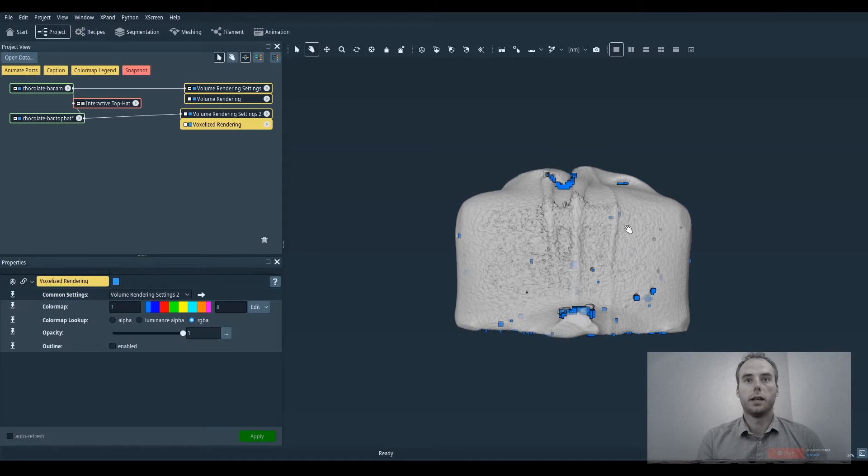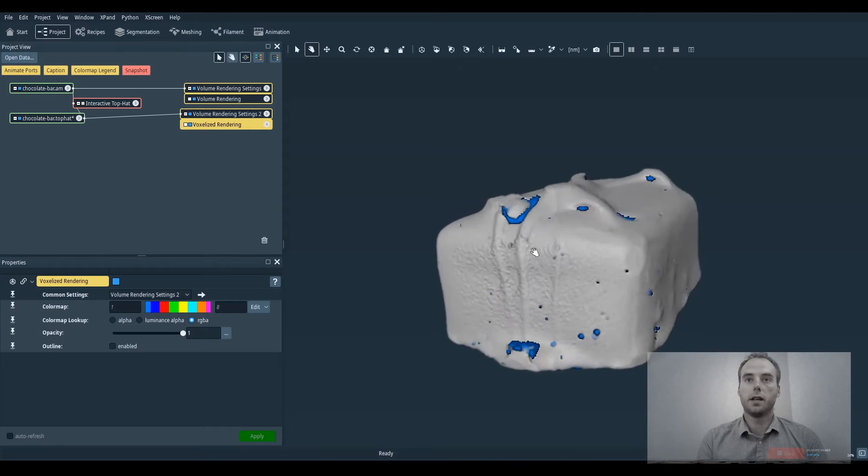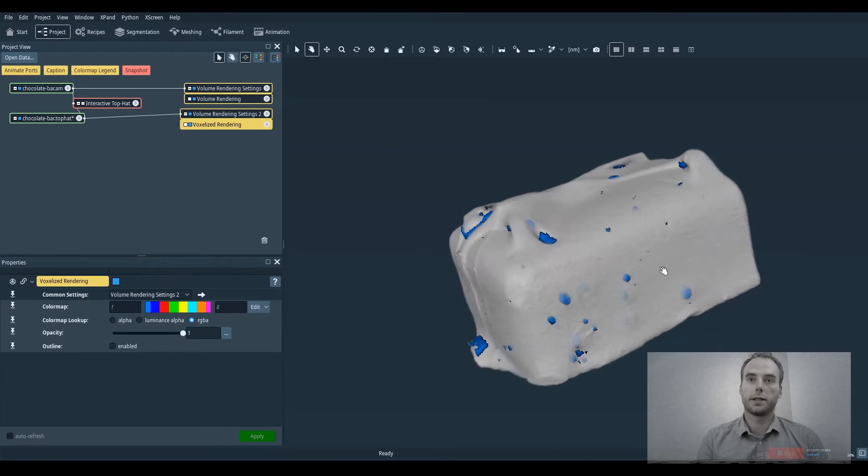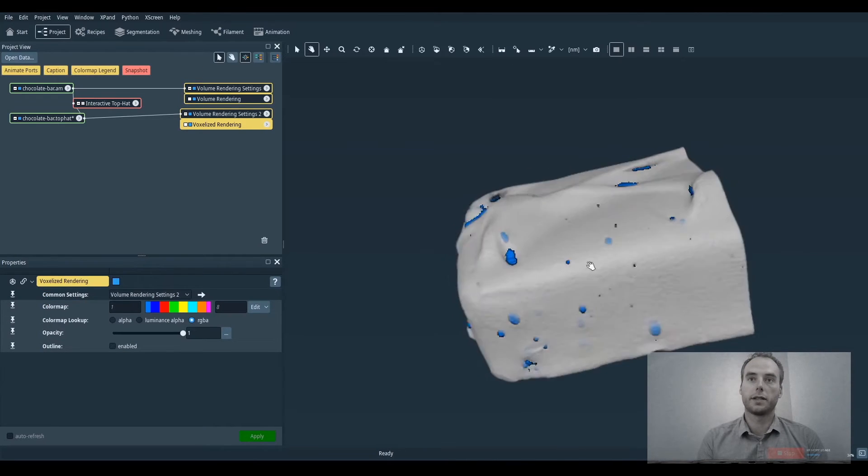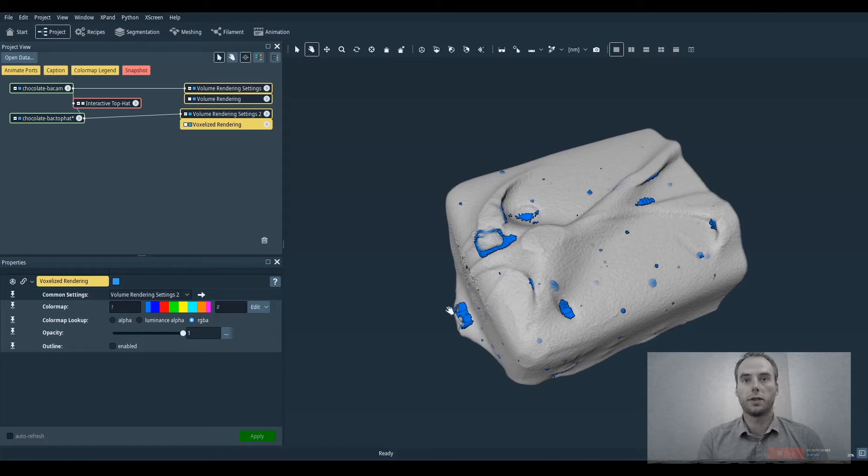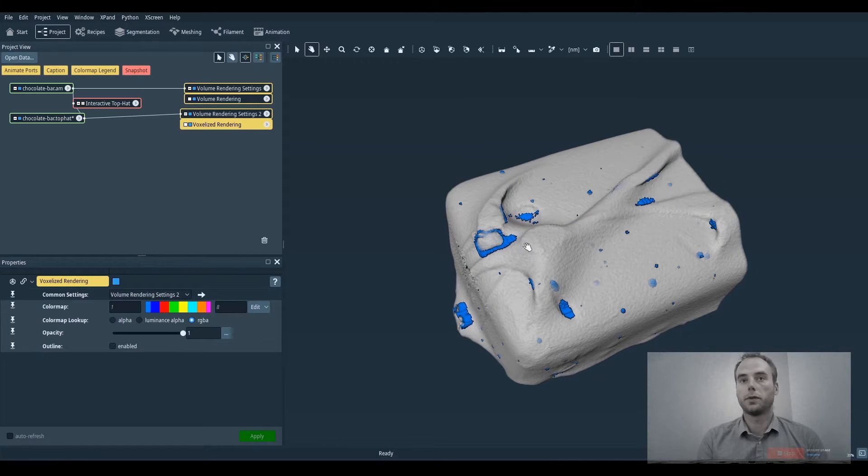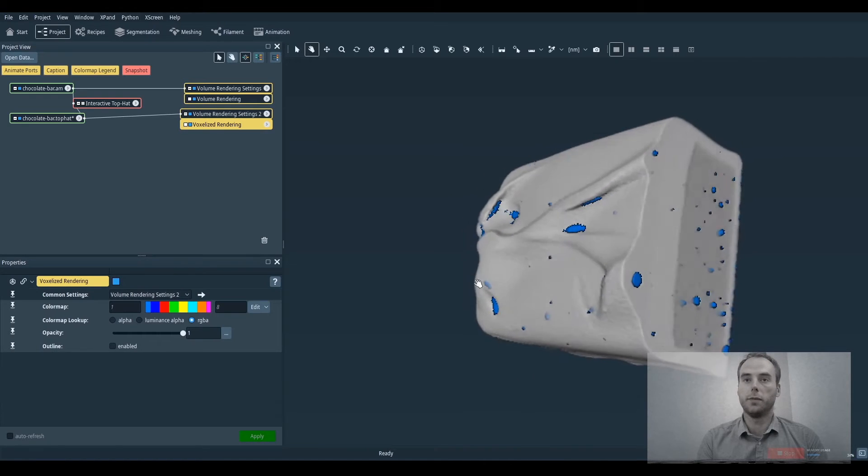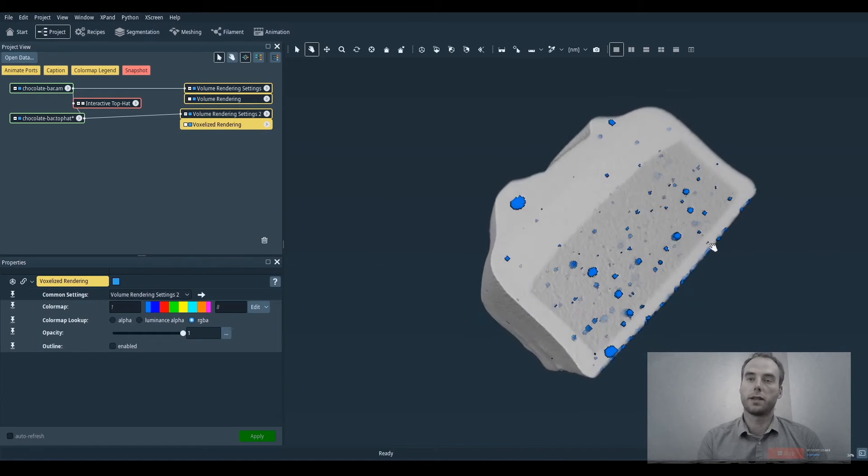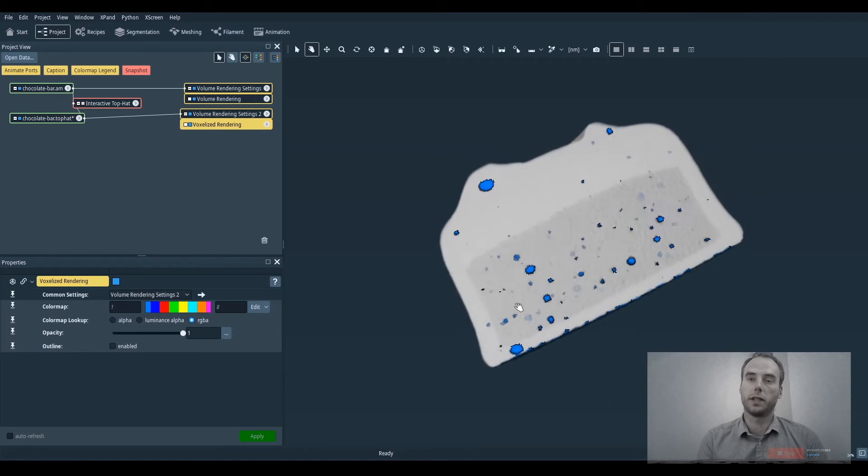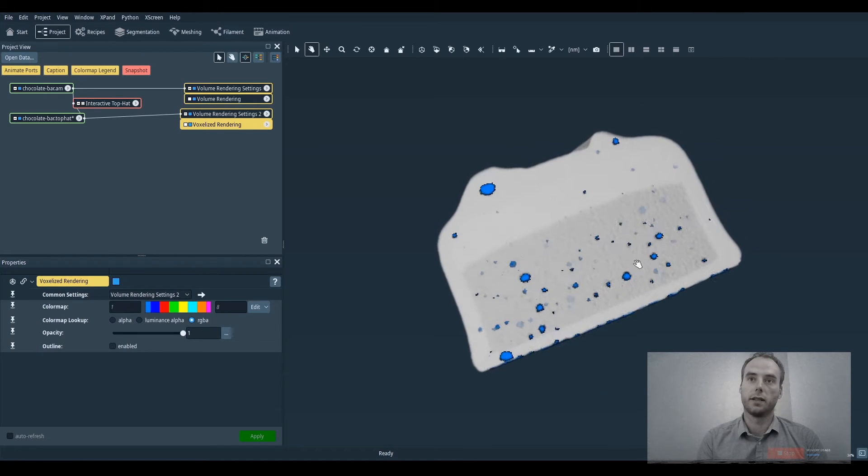And as you can see there are several areas where the internal porosity segmented do not really correspond to internal porosity but rather to open cavities instead.